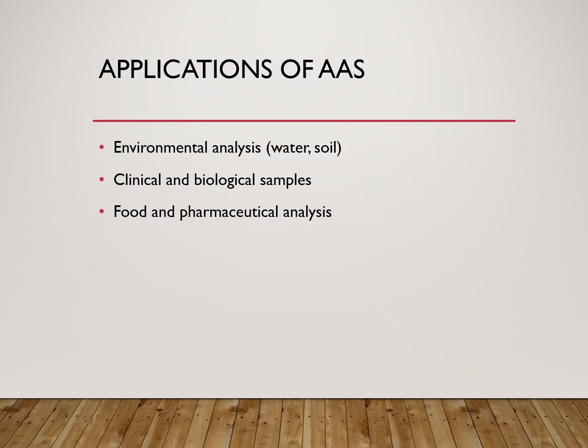Now the applications of AAS are widely used in environmental monitoring, clinical chemistry, food analysis, pharmaceutical analysis, metallurgy and industrial quality control.